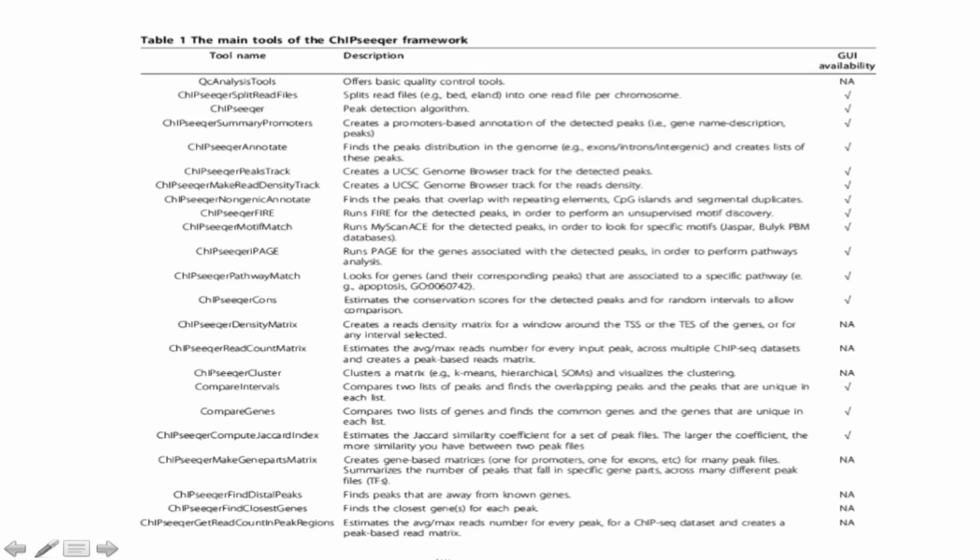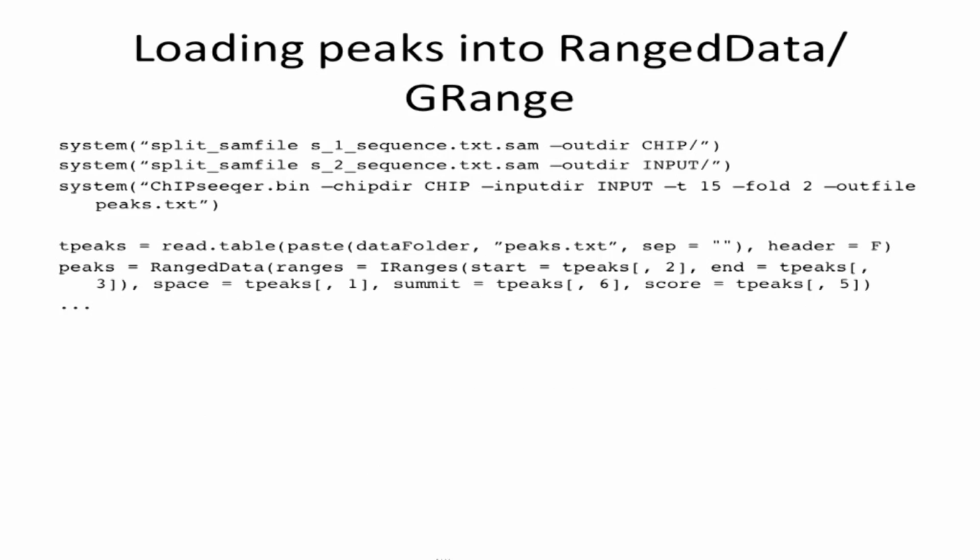These are some of the tools that we have. We have a whole framework that allows you to do many, many different things using ChIP-seq data. And it's not yet an R package, but as we discussed multiple times, it's reasonably easy now to integrate the command line within your R package.